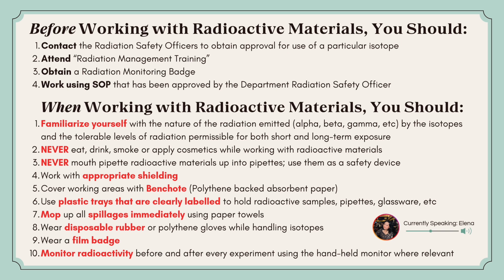In addition, you should wear a film badge to help monitor radioactivity. And lastly, you should monitor radioactivity before and after every experiment using the handheld monitor where relevant.